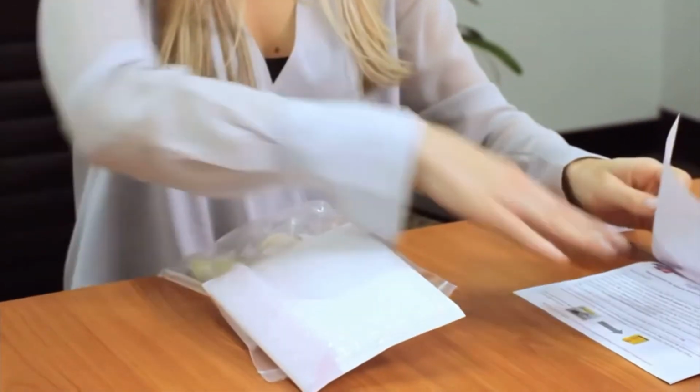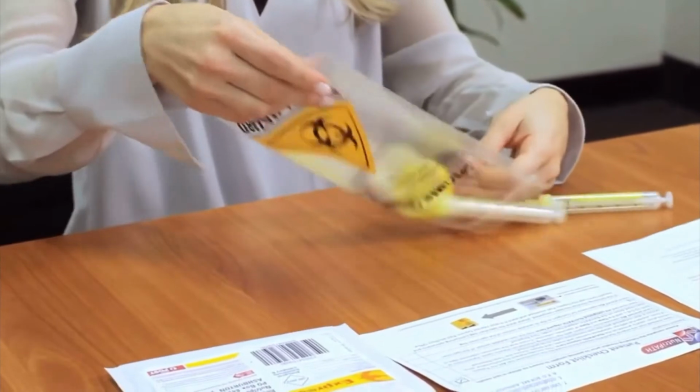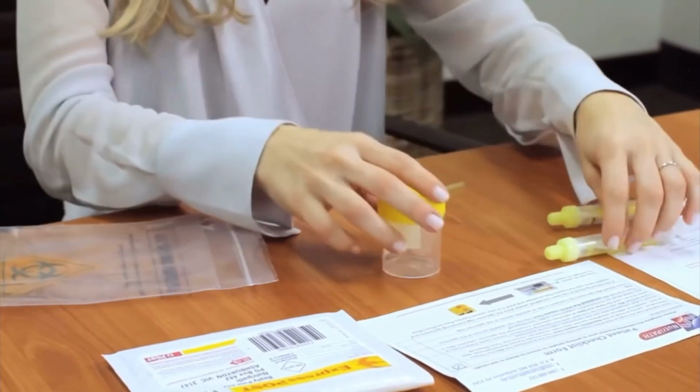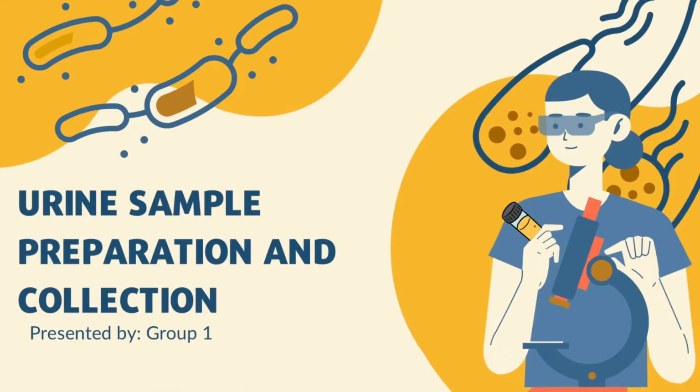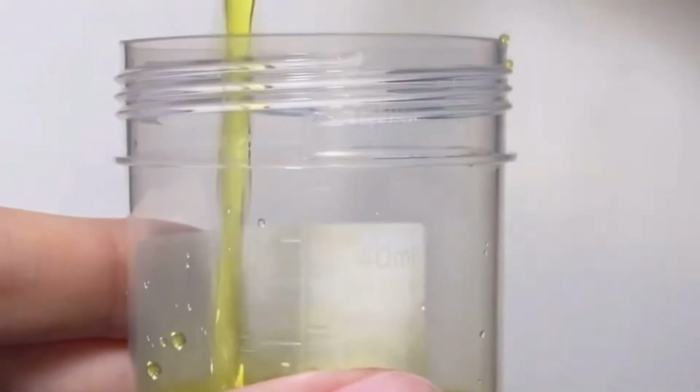We will tackle the first part of the topic in Module 10, which is the urine specimen collection. At this point, we will talk about the proper collection and preparation of urine specimen for laboratory testing. As we all know, blood is not the only specimen that is tested, as there are also other specimens that are being used for diagnosing the condition of patients.